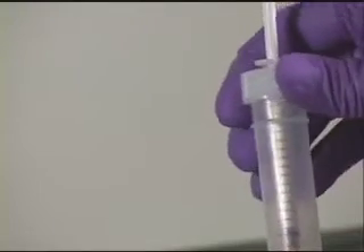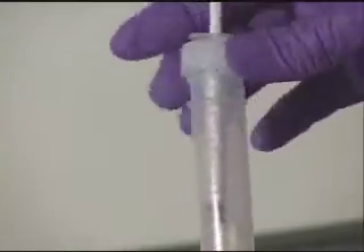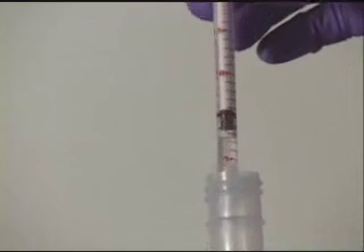Remove the titration syringe and read the TAN value where the bottom of the black plunger aligns with the TAN increments printed on the side of the syringe.